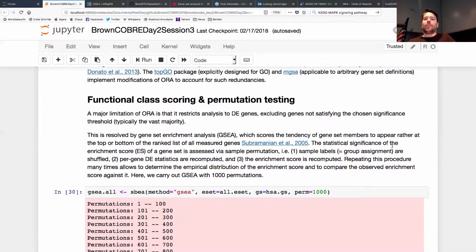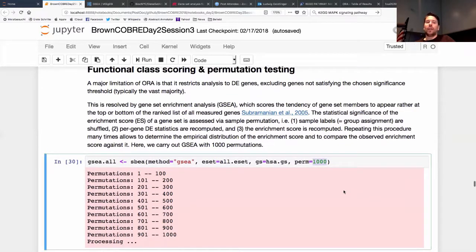So as I said, gene set enrichment analysis, the great thing is you work on the complete vector of genes. Another thing is you do not assume any particular distribution, but you rather sample your labels of your cases and controls and try to estimate the underlying distribution of enrichment. So you don't have the hypergeometric distribution as before, but you rather take an empirical distribution by permutation. So it's an underlying permutation test statistically. It's always the question, how many permutations do you do? If you do a lot, it gets computationally intensive, okay? A good number is doing 1,000 permutations, which you can still do for microarray data and KEGG gene sets in minutes, yeah?